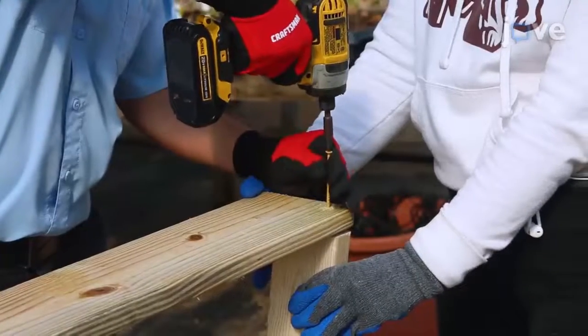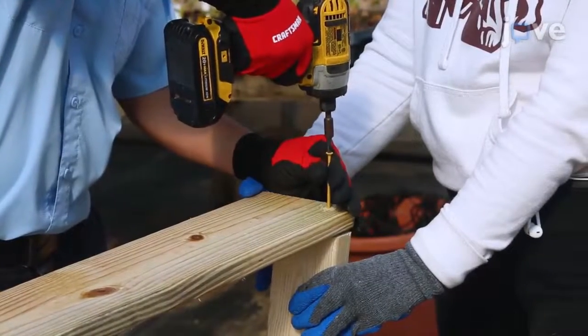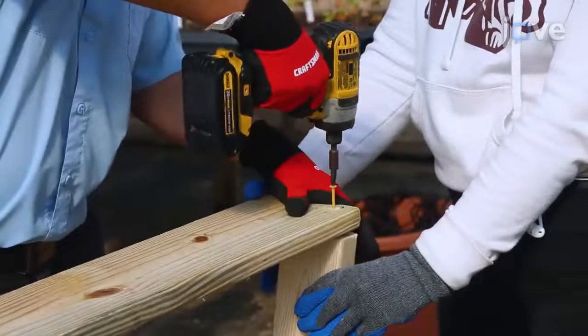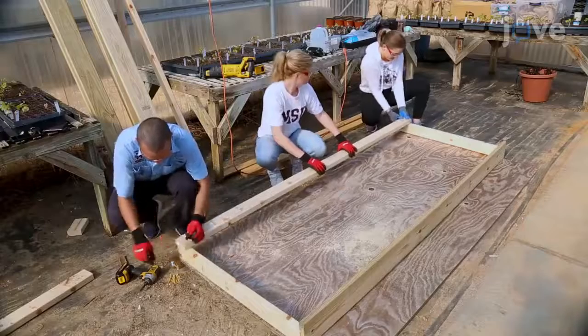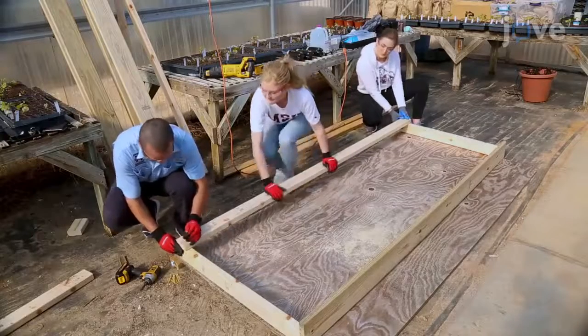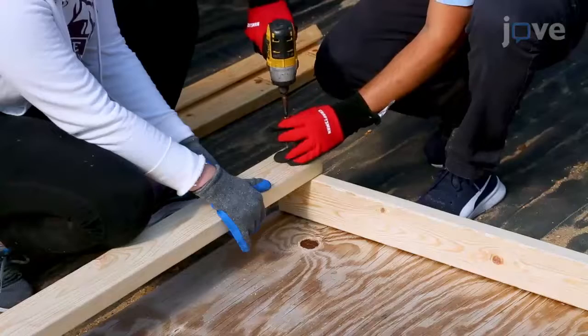Screw one more 0.91 meter piece 1.22 meters from each end for support. Then place a 2.44 meter board across the back of the 0.91 meter stands and screw into place for support.